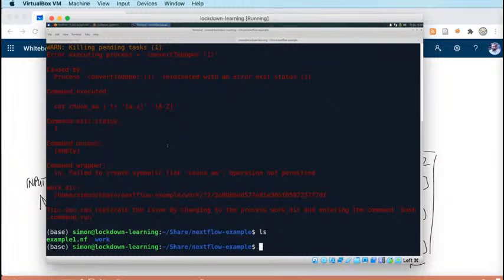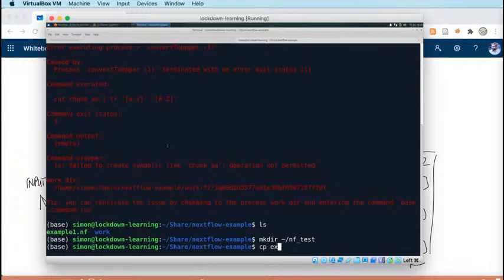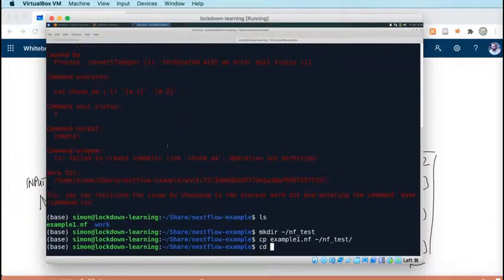I wonder if that's the case. Let me make a directory in my home directory. And let's copy example1 to home/nf test.